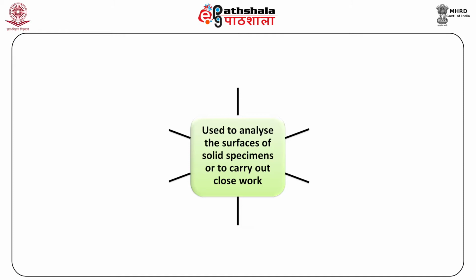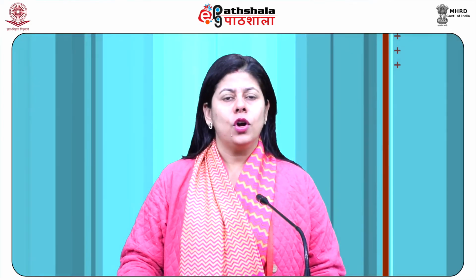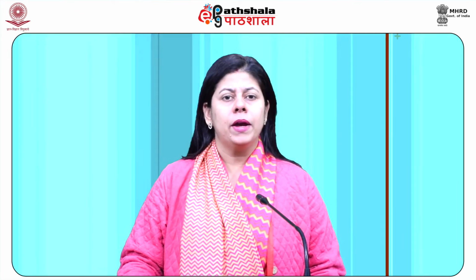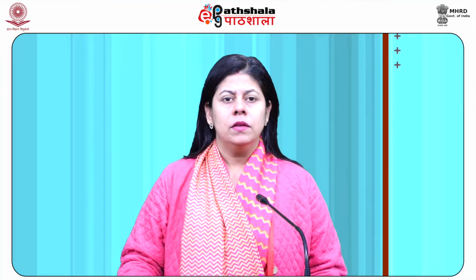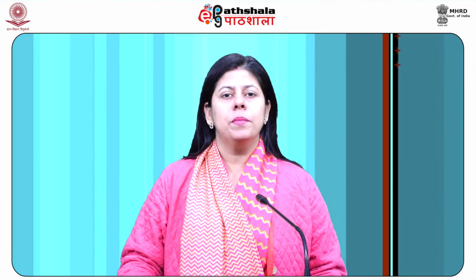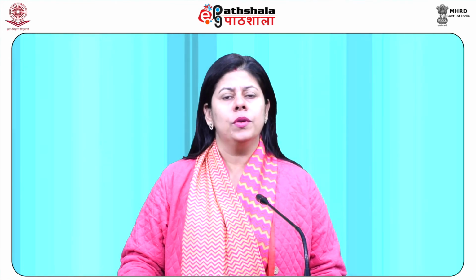The stereo microscope is frequently used to analyze the surfaces of solid specimens or to carry out close work such as sorting, dissection, microsurgery, watchmaking, small circuit boards, manufacture or inspection, etc. The stereo microscope should not be mixed up with a compound microscope fitted with double eyepieces and a bino viewer. In such a microscope, both eyes get the same image, but the binocular eyepieces deliver greater observing comfort. However, the image in such a microscope is no different from that obtained with a single monocular eyepiece.